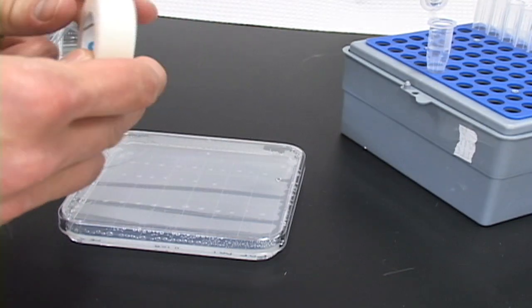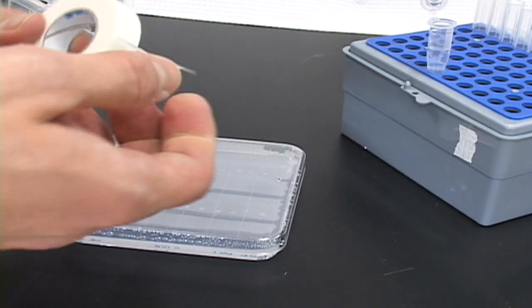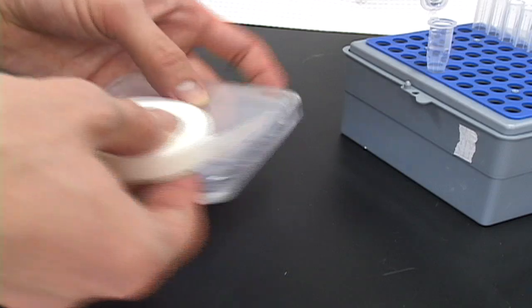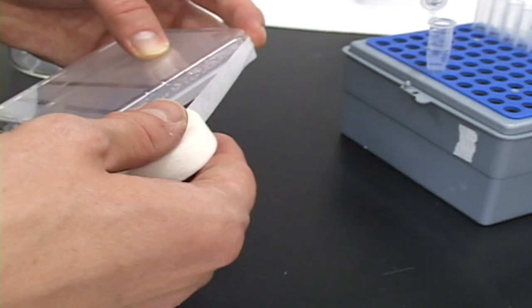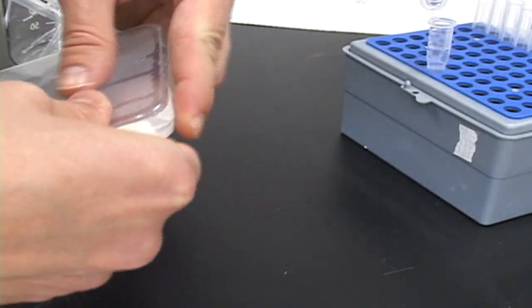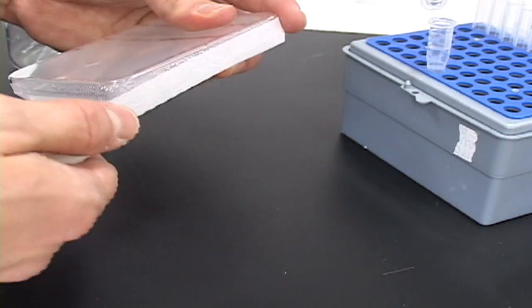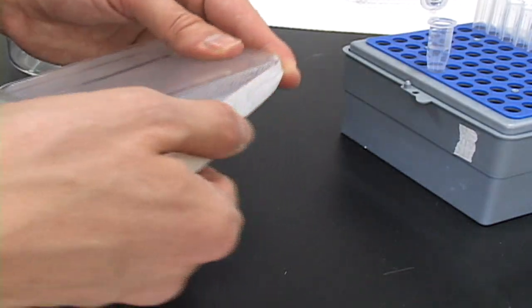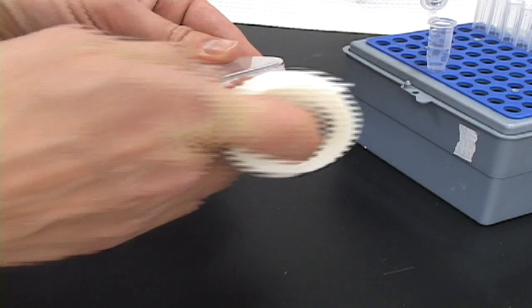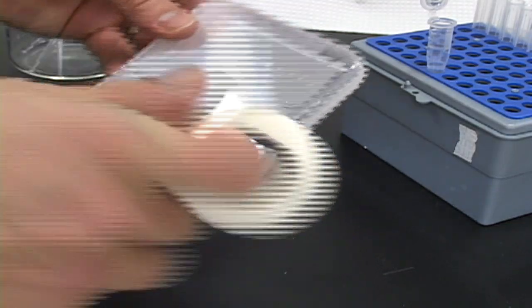After all seeds have been plated, close the lid and seal with micropore tape. This tape is also known as paper tape and can be found in most first aid kits. This tape allows for gas exchange but acts as a microbial barrier. Place the sealed plate in a dark 4 degree Celsius refrigerator. After 3 to 5 days, place the plate vertically under the light source.